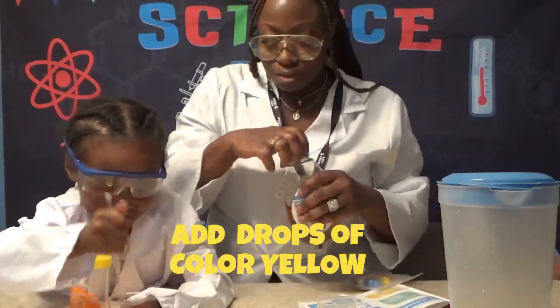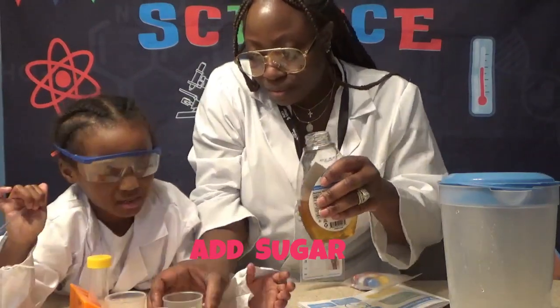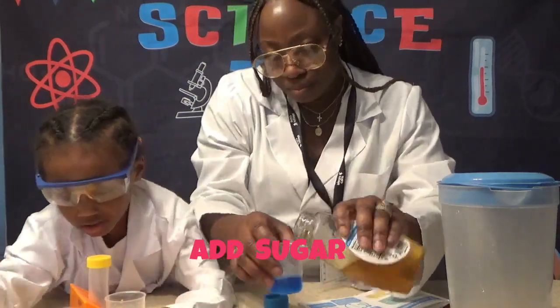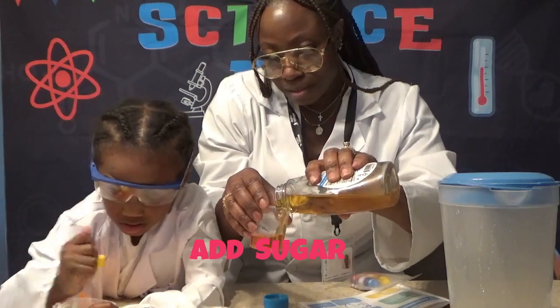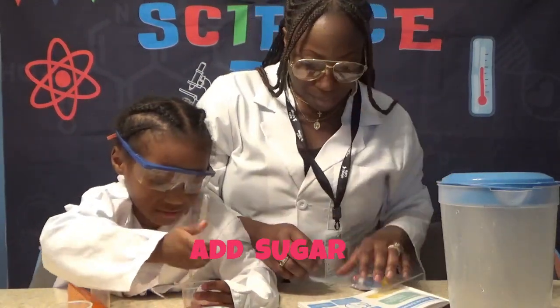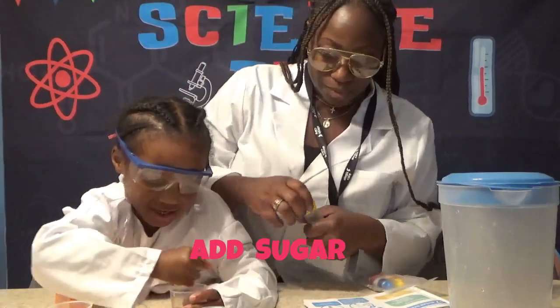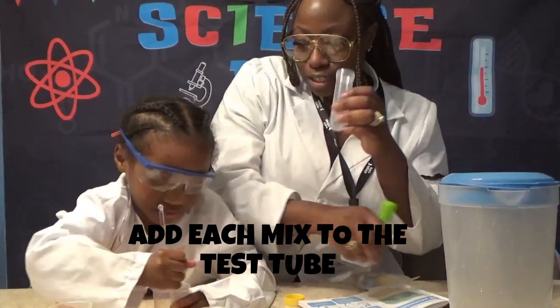Now we're going to add sugar — thank you — and then stir that one. We're going to pour into this test tube, so let's start.